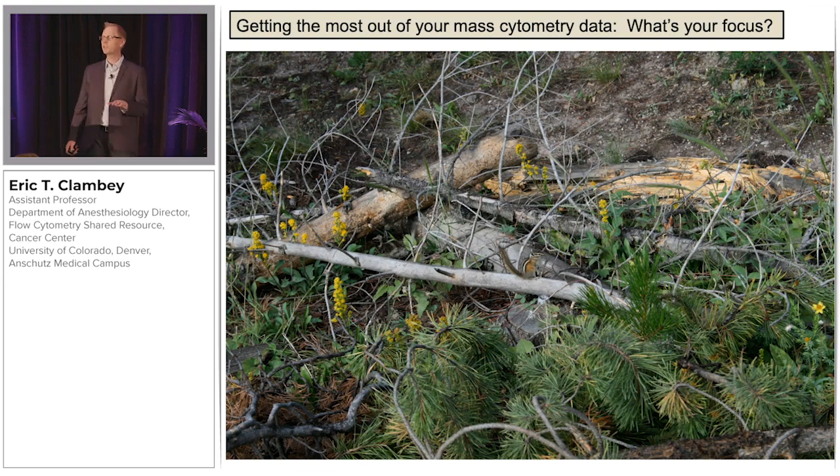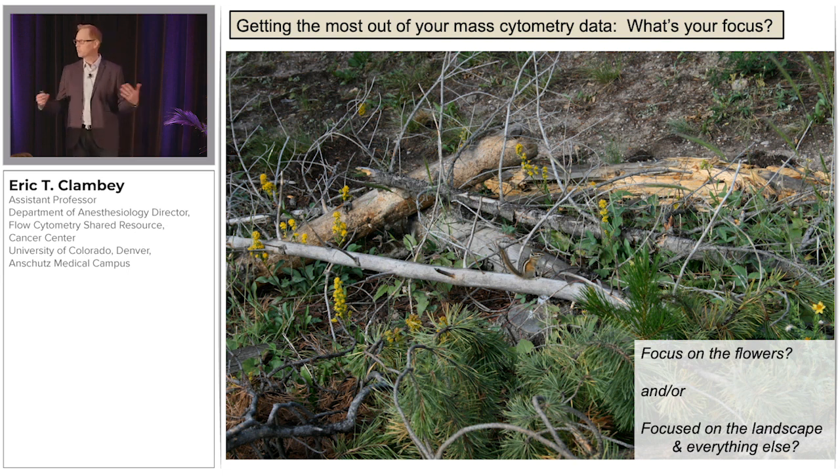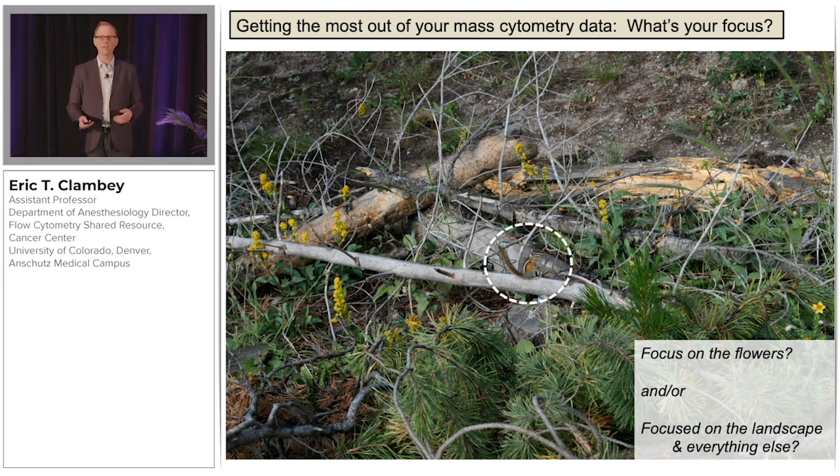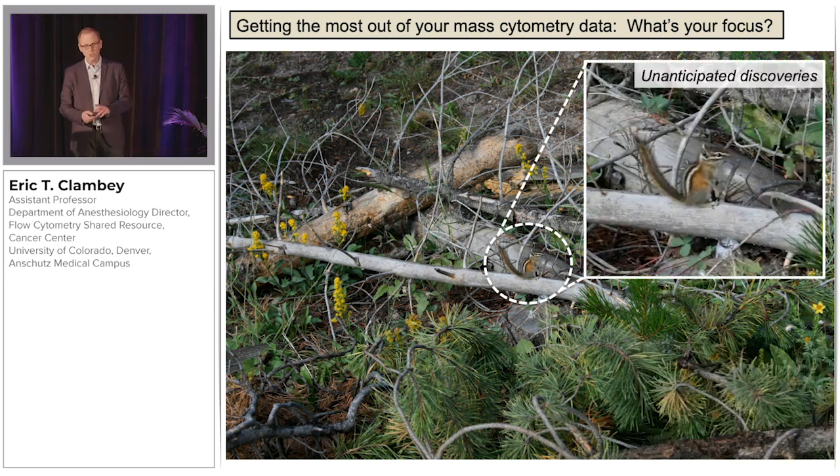So the first question to consider when you think about CyTOF data analysis is, what's your focus? Are you focused on the flowers in this image, or are you focused on the entire field and the landscape? Now, CyTOF has amazing breadth and depth for analysis, and many of us are interested in the possibility of identifying unanticipated discoveries, such as this chipmunk buried in the middle of this image.